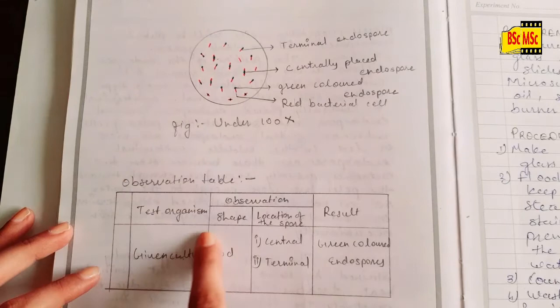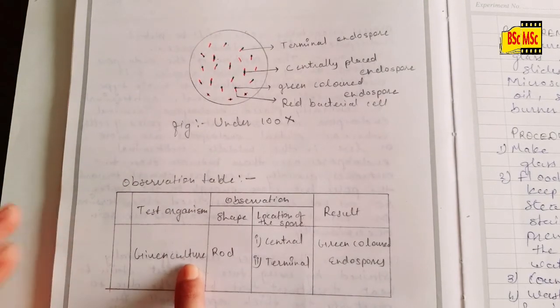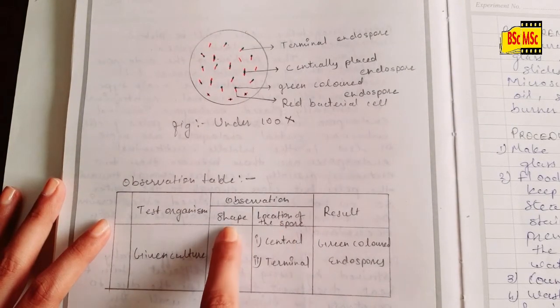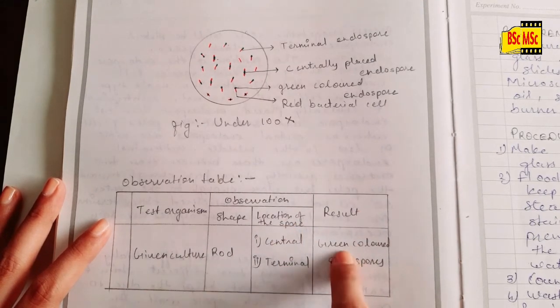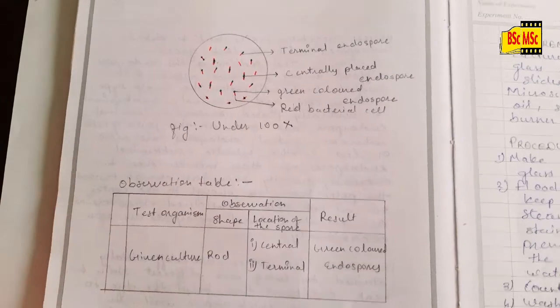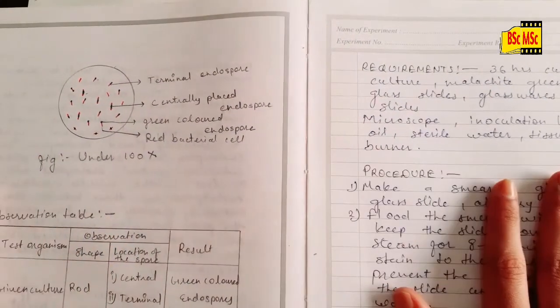Then you need to write down the observation table. So again, the given culture, and then the observation: the shape and the location of the spore, and the result. Green colored endospore appeared. So this is all about endospore staining.